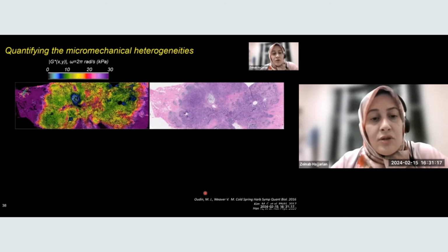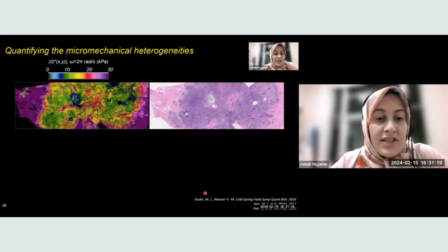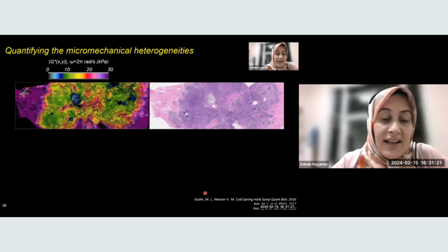So we decided to do some texture analysis to better understand the micromechanical heterogeneities. And this is important because in the context of clinical setting, breast cancer is characterized as being a very heterogeneous type of disease.